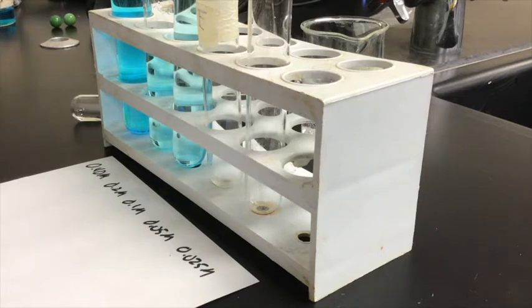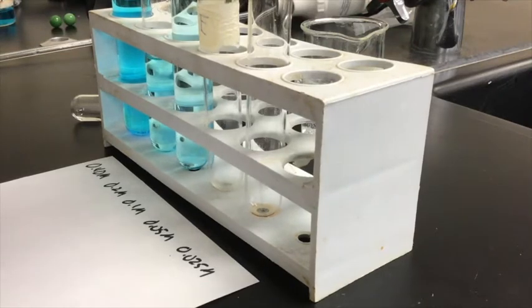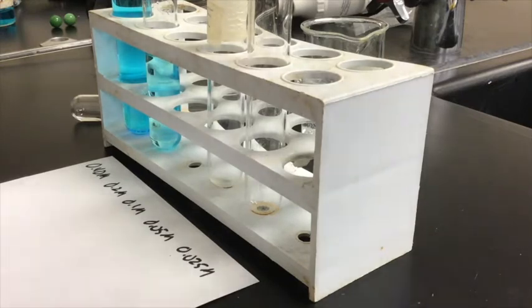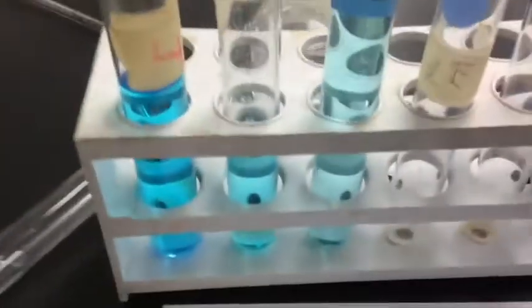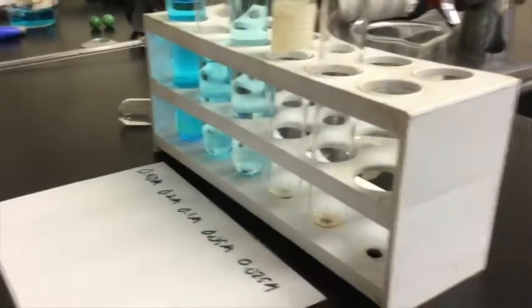So I started at 0.4, and I took 10 and added 10 of water, and that cut it to 0.2. And then I took 10 of the 0.2 and added 10 of the water, shake that up, and that cut it to 0.1. So now I have cut that in half again. Again, if we take a look at this, you can definitely tell that these are getting lighter and lighter as we go along with them.